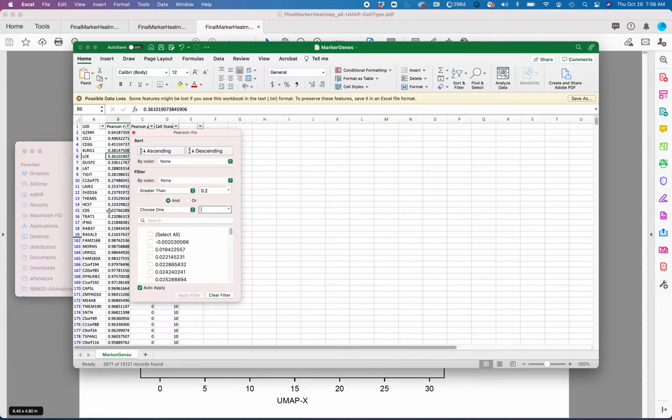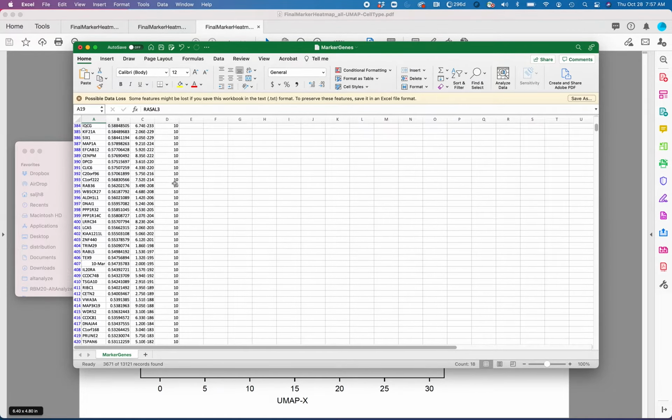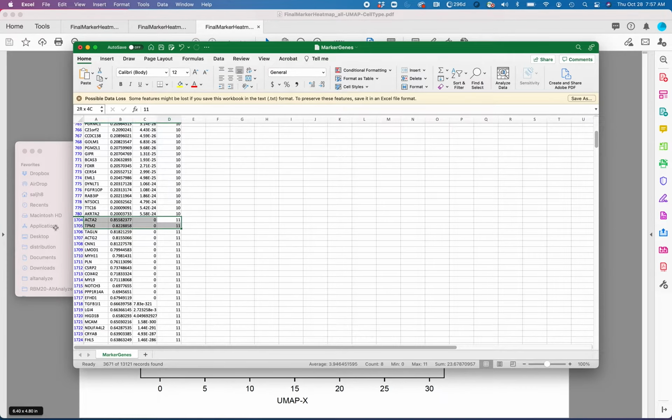and if you wanted to expand this list, we could simply decrease this filter here and take these genes and input them for gene set enrichment to another program such as ToppCell, which we're not going to do right here. But again, that is an exercise the end user is recommended to perform to validate the identity of these clusters, or just look at these markers in the literature. These exist for every single cluster you can see here, and you can just scroll down to whichever cluster of interest. They're displayed by cluster number rather than the predicted cluster name that we saw before. Here again, we see a fibroblast-like cluster based on the marker genes that we're seeing expressed.